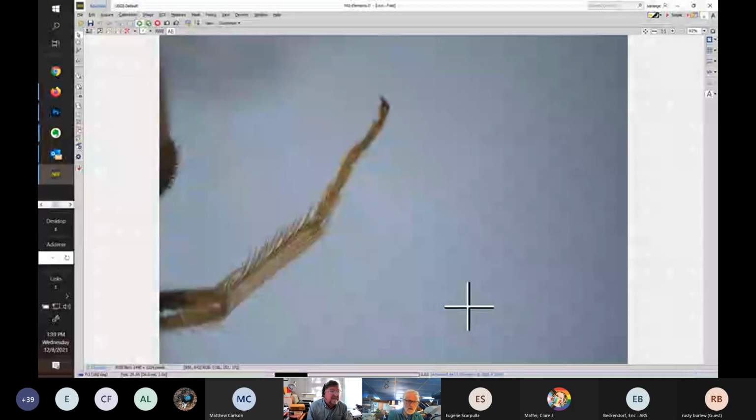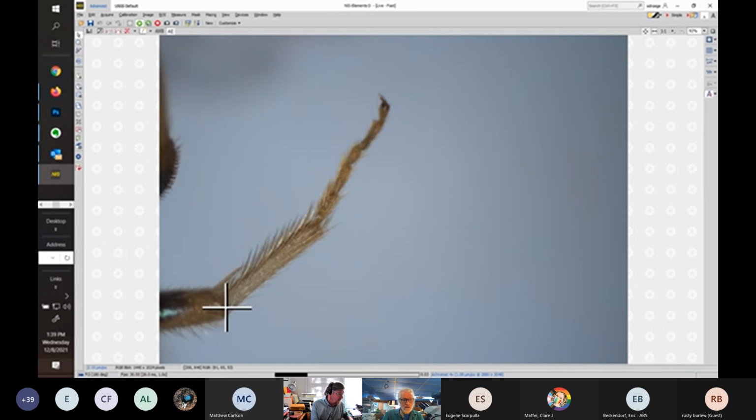So this is aurata, and this is the rear leg. Here's the tibia. This is the basitarsus, the first tarsal segment, very long. The place to look, and I know of no other feature on the basitarsus, is the length and the pattern of these hairs. Mike, go ahead and talk about the different patterns, and I'll point them out. Depending on how you orient the specimen, you can fool yourself into thinking you're seeing something that's really not there. This is a very good shot that Sam's got lined up here of male aurata. Those hairs are all pretty much the same length, and when we look at persimilis, it'll be a little different. The sternites are also different between the two, and we'll probably look at those in a bit as well.